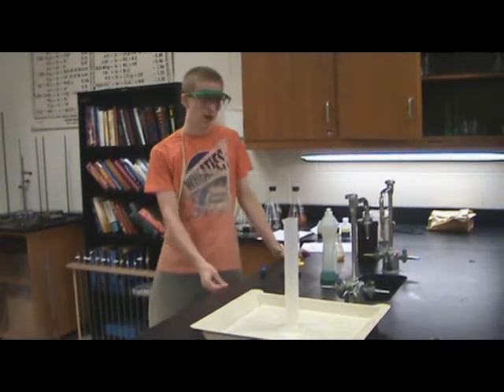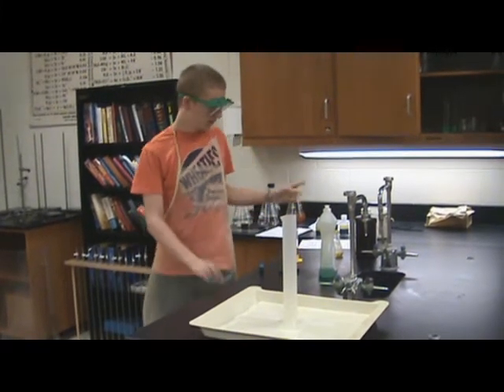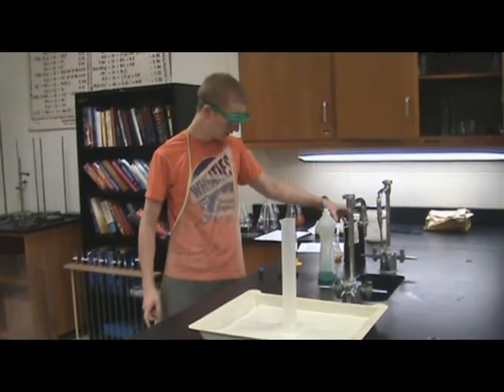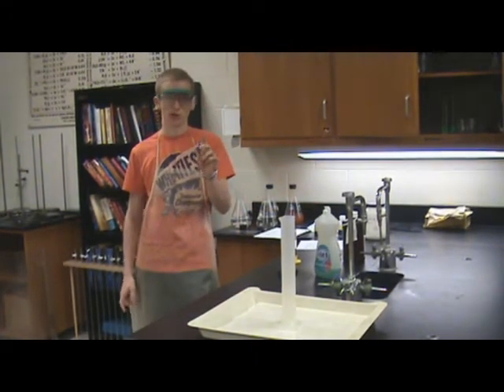All right, today we're going to do the elephant toothpaste reaction, or old foamy — it's another name for it. Basically, you need hydrogen peroxide, saturated KI solution, some soap, and food coloring if you want to color.